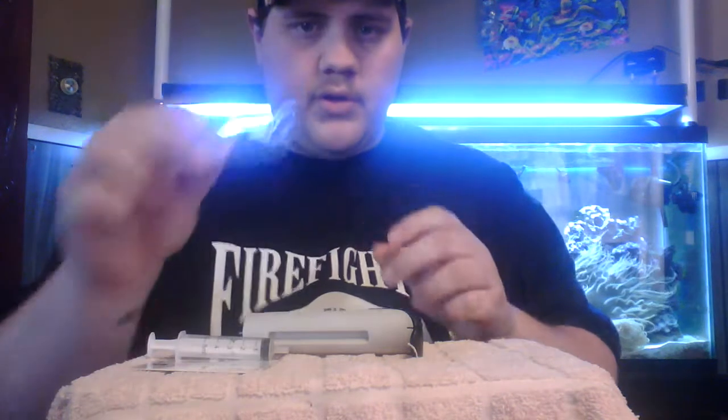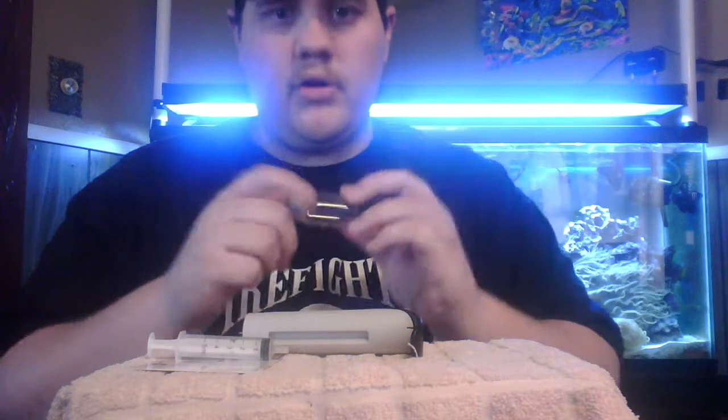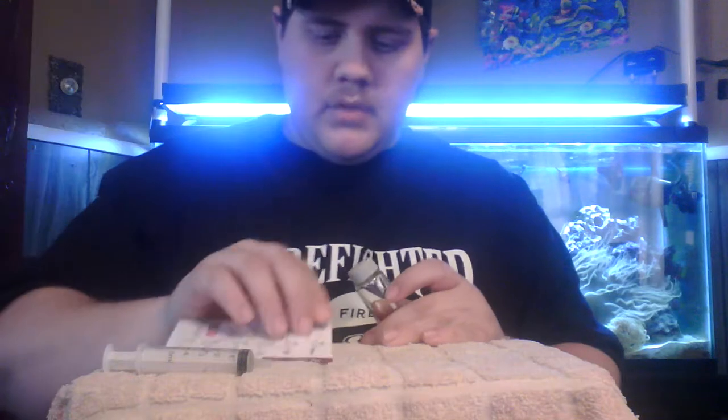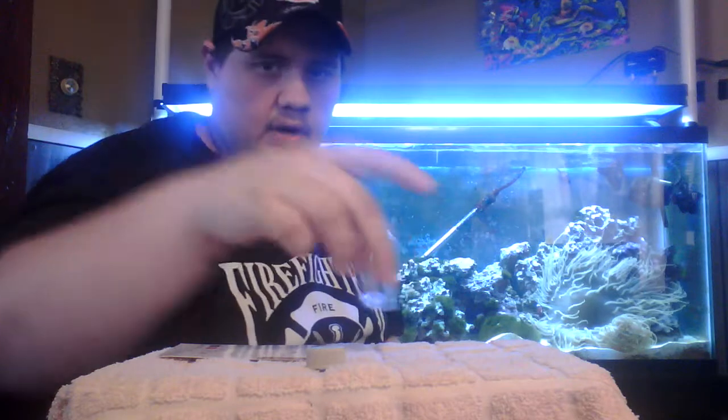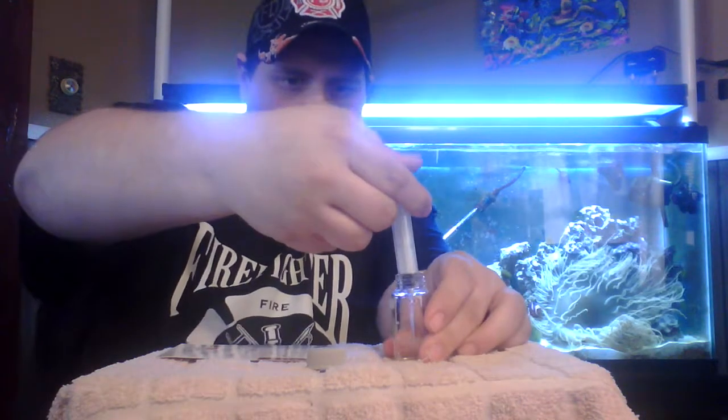Every time you use these, you want to rinse your vials in RODI water when you're done. This one has already been rinsed. The first thing you want to do, according to our little card, is rinse your vial in the water to be tested. So we'll take a full syringe and put it in the vial, give it a little swishing and swirling, then get rid of that water.